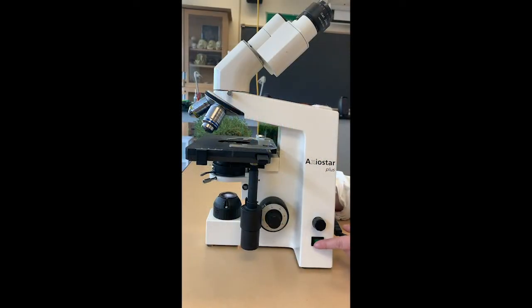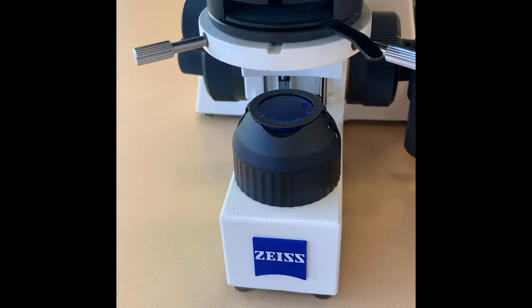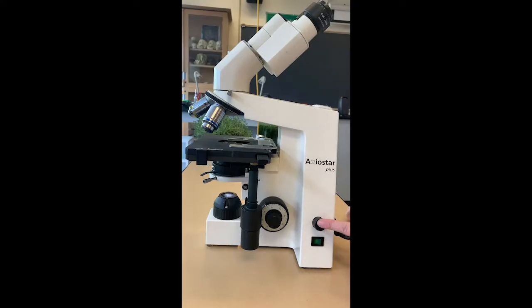To turn the microscope on, we have an on-off switch. When that's turned on, a light bulb goes on in the field diaphragm here. Right above the on-off switch, we have an adjustment knob. It's basically a dimmer switch for the light bulb.